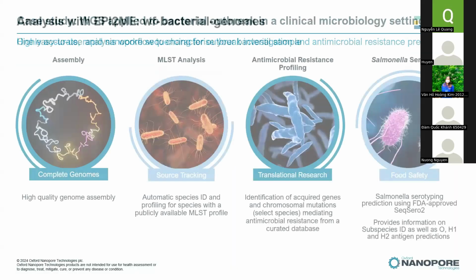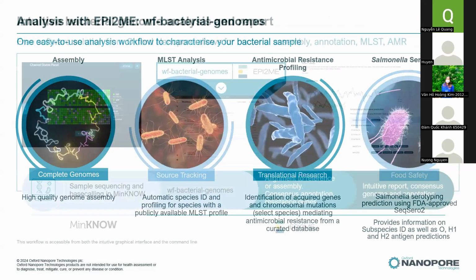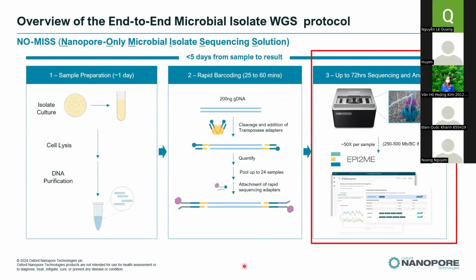Yes. It's not required. It's not compulsory for you to do the fragment analysis before you start sequencing. It's optional, so you don't have to.